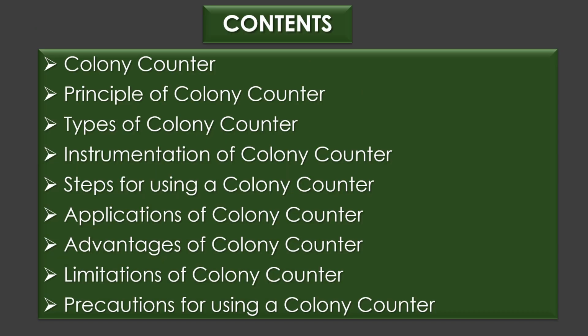The contents of this video contain an introduction about colony counter, principle of colony counter, types of colony counter, instrumentation of colony counter, steps for using a colony counter, applications of colony counter, advantages of colony counter, limitations of colony counter, and precautions for using a colony counter.